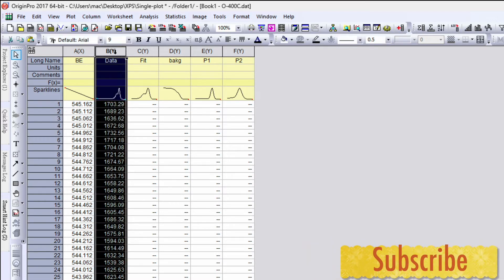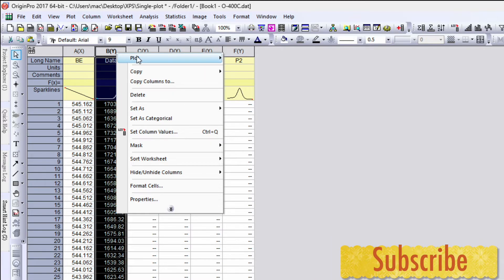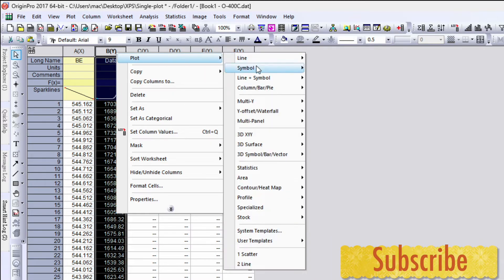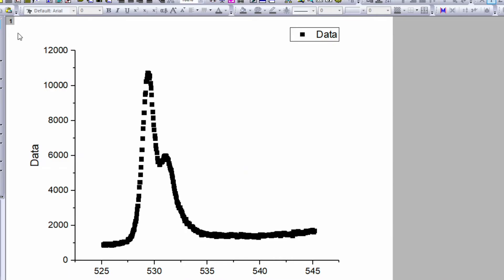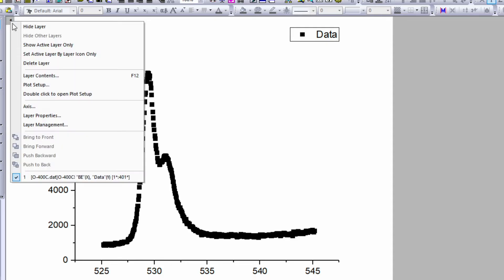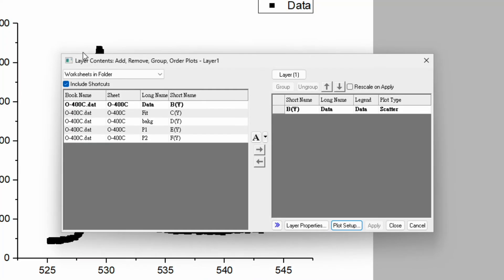Select the data, right click, go to plot, then go to symbol and click. Now here you can see number 1 is returned on the left top corner. Move your cursor over there, right click, and go to layer content. The shortcut is F12. Click over here.